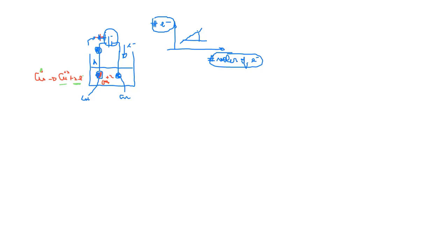You don't see it here very well, but we are going to have a device that will allow us to measure the current, and we will measure the time. So by measuring the current and time, we know how much charge in coulombs passed through the circuit.